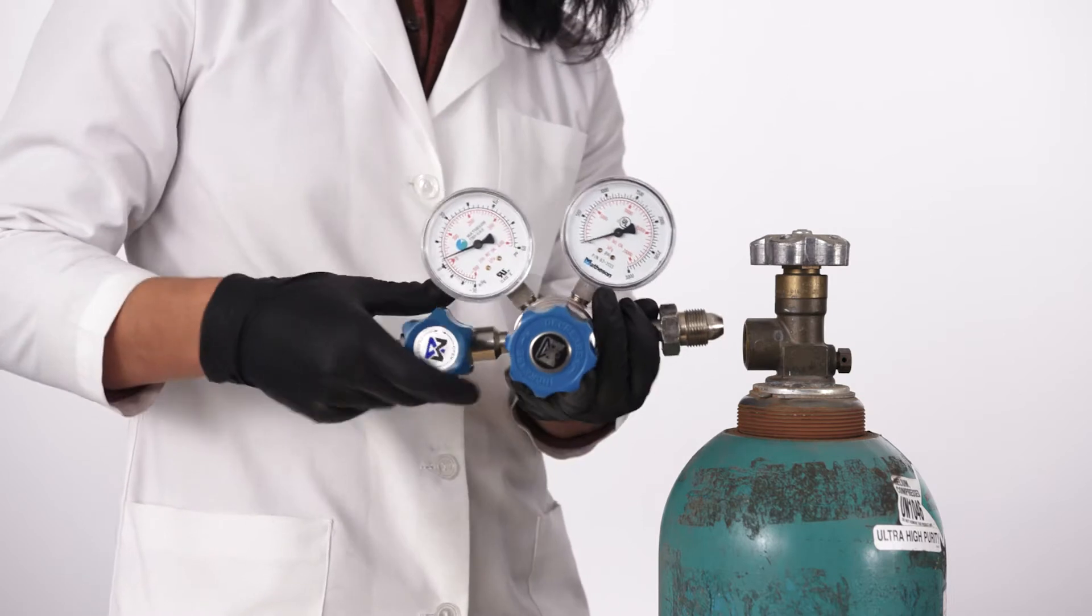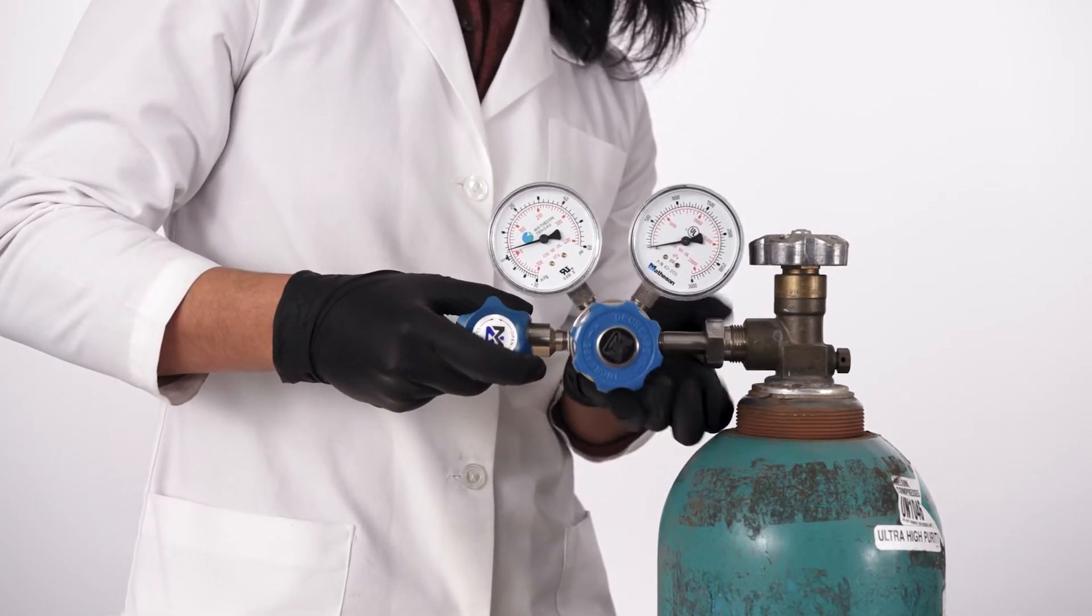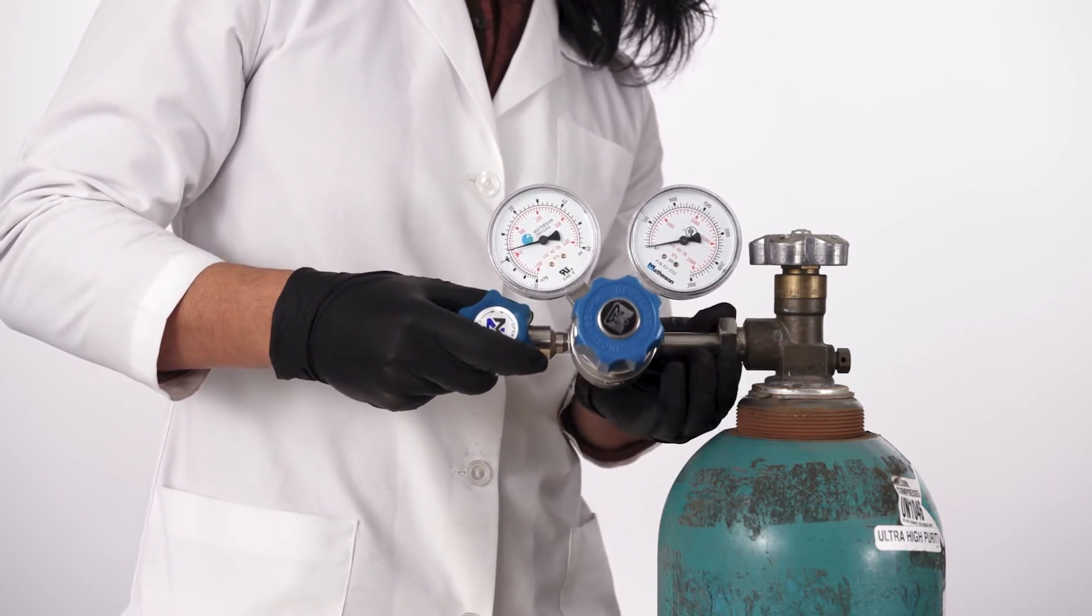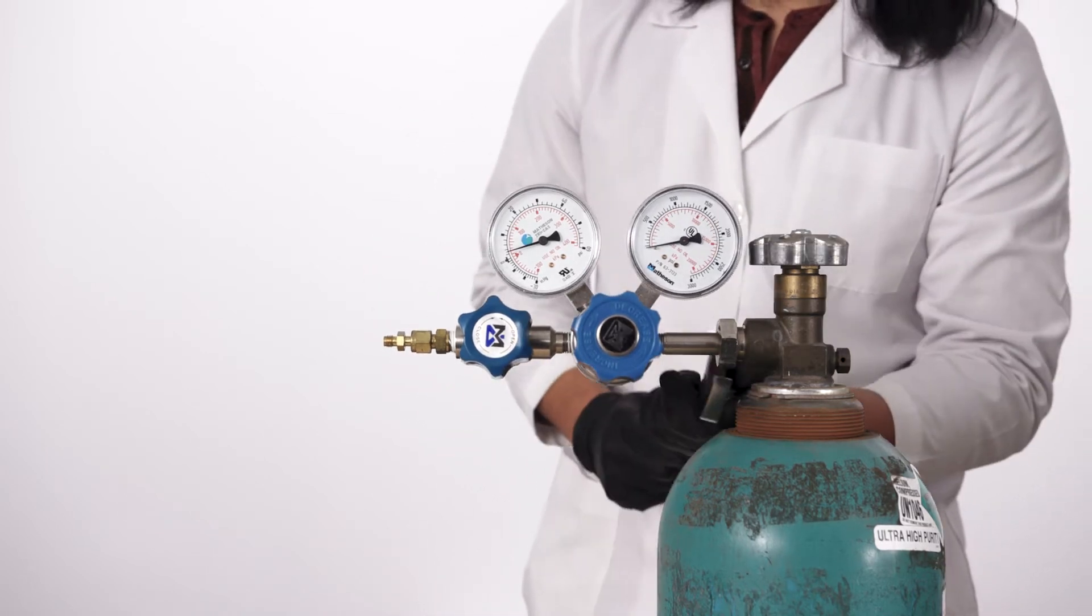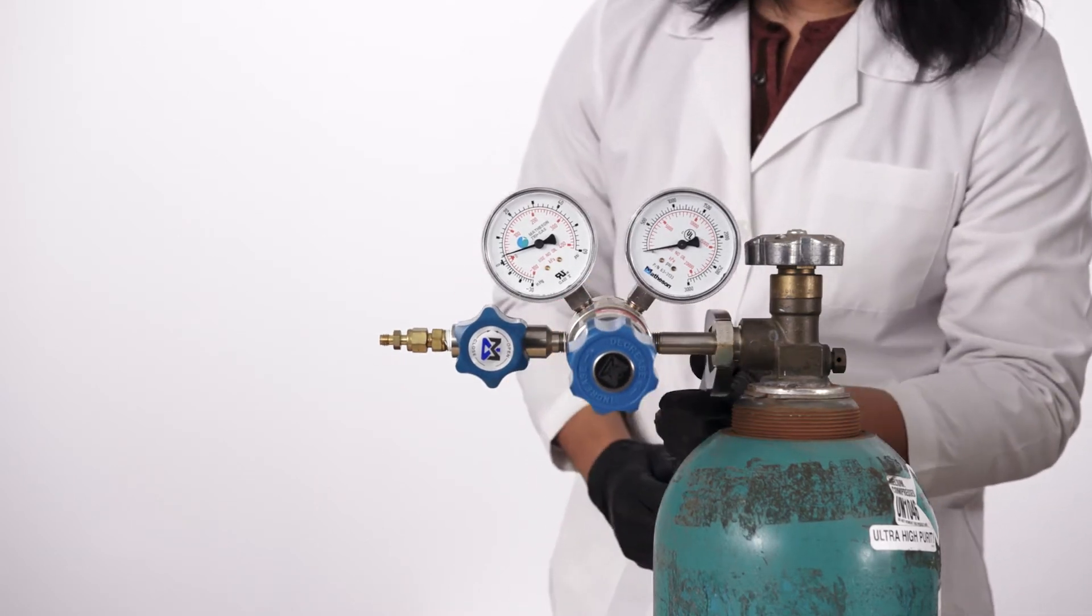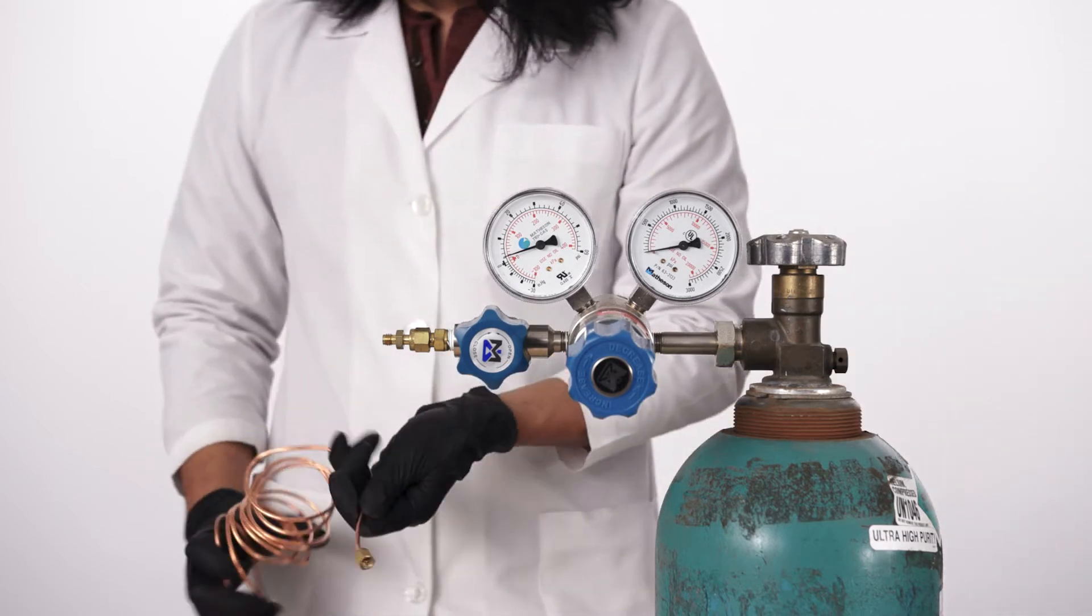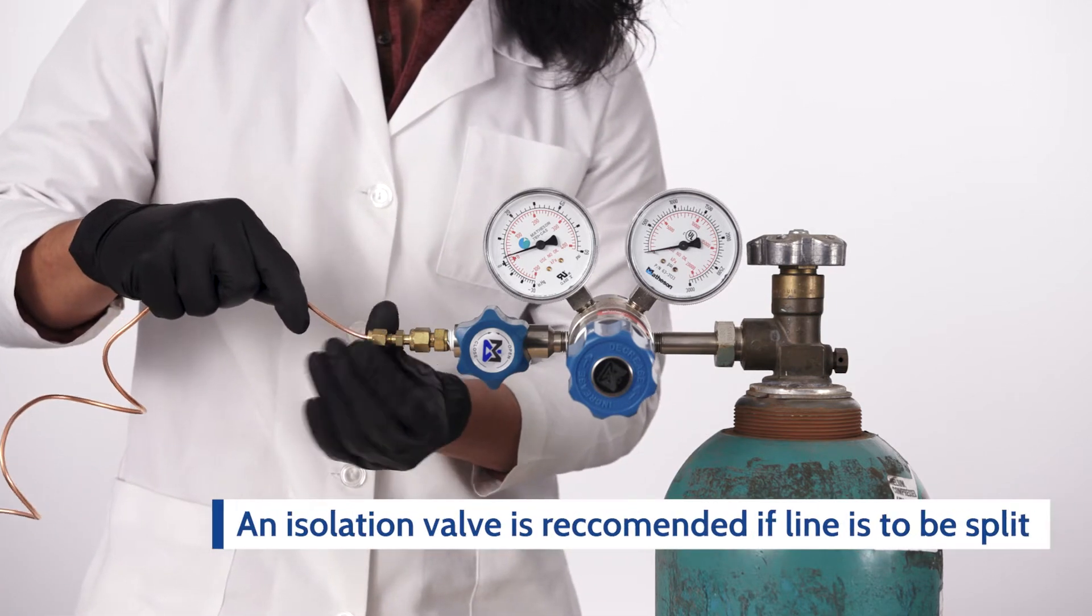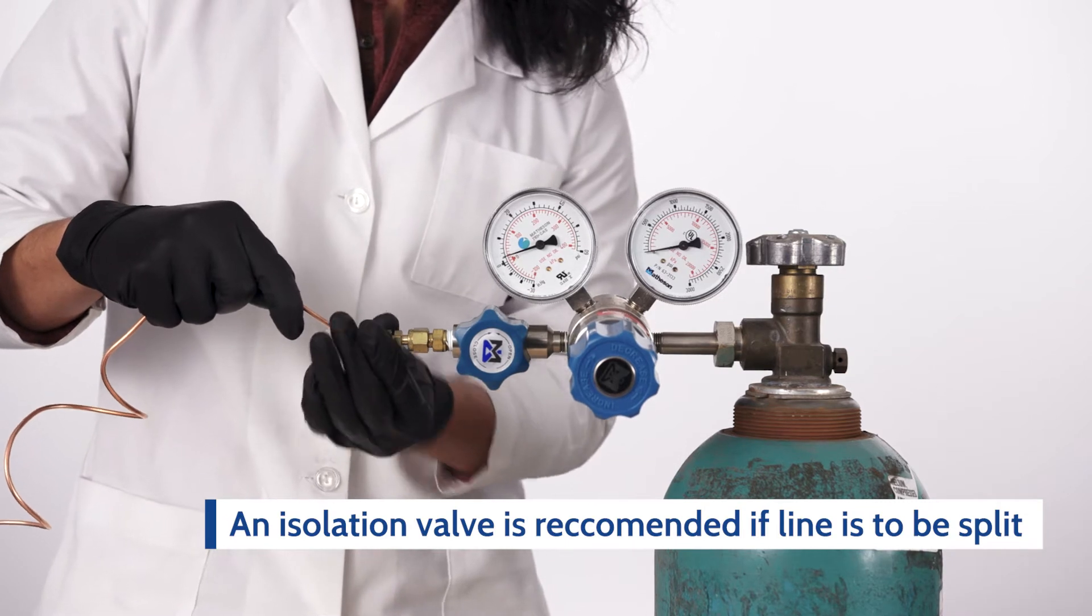Install the regulator on the cylinder. Now install the gas tubing assembly to the regulator. An isolation valve is recommended in between if the line is to be split.